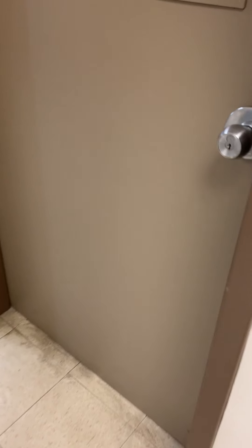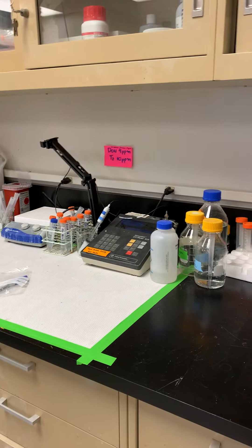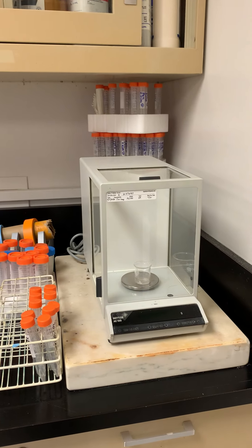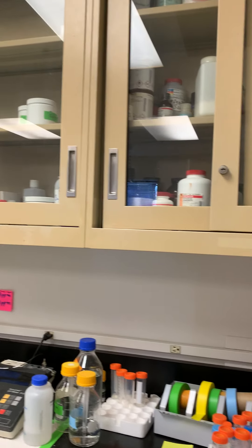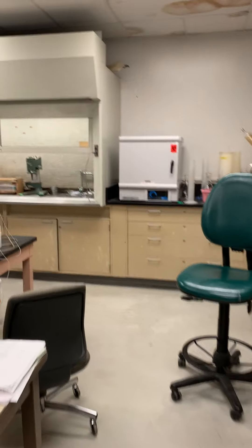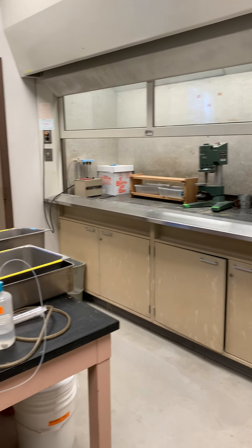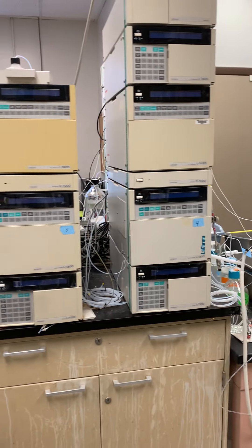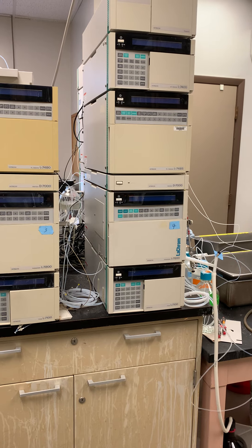Now let me show you the other lab. In this lab I have a hood on the bench, a pH meter, and a four-digit balance. There are also cabinets here. Then I have a hood for sample preparation, extraction, and clean-up.